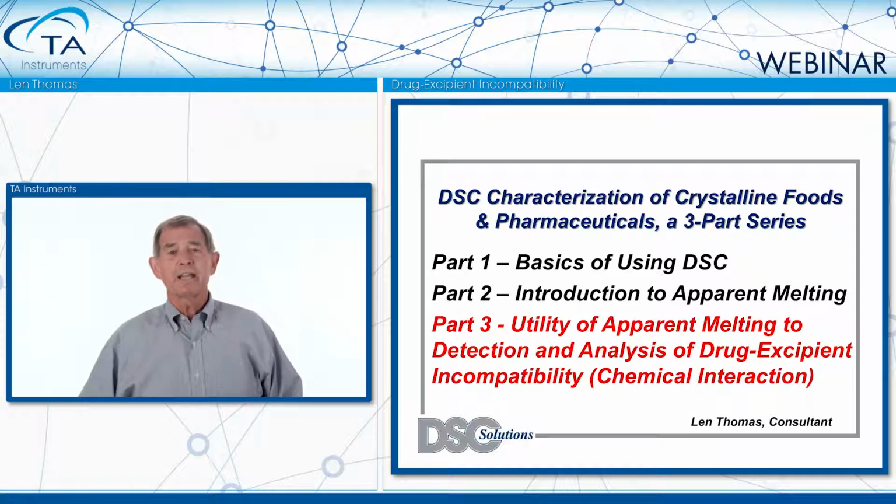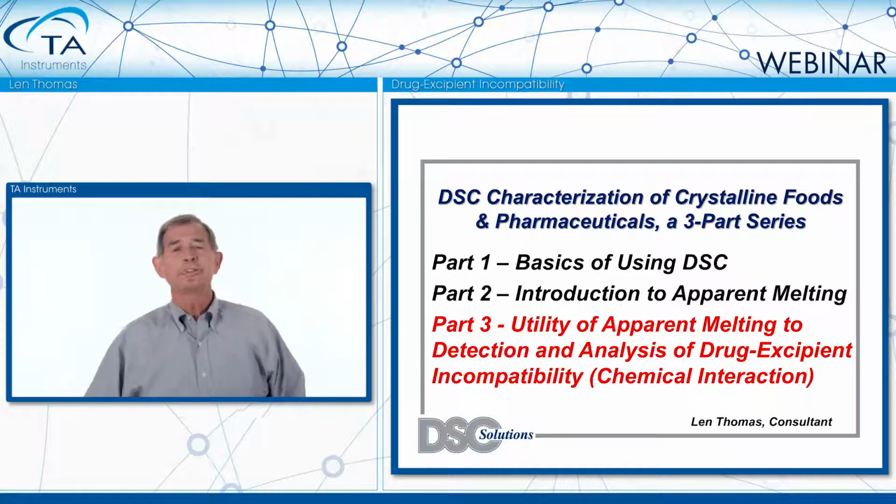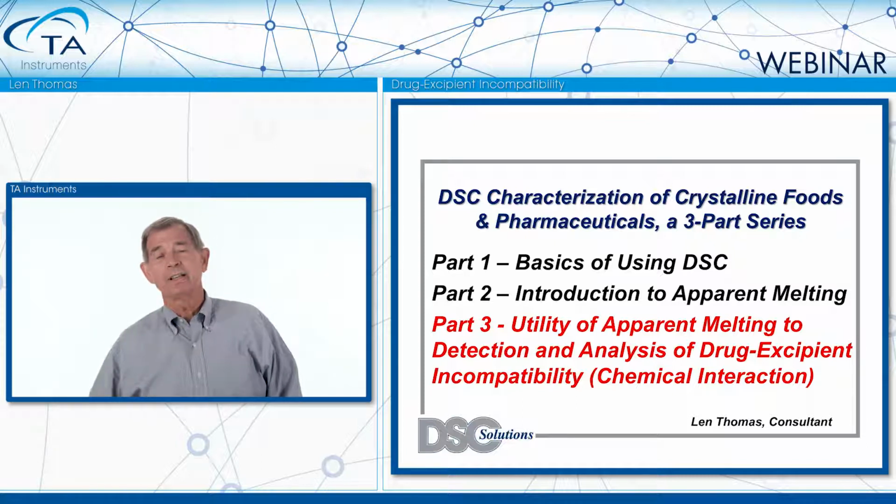The subject for today is also going to be new to many, and that subject is how we can use apparent melting to detect and analyze drug-excipient incompatibility. Well, that's a big name and a long term, but really what we're dealing with is trying to detect interaction between two materials when they're mixed.